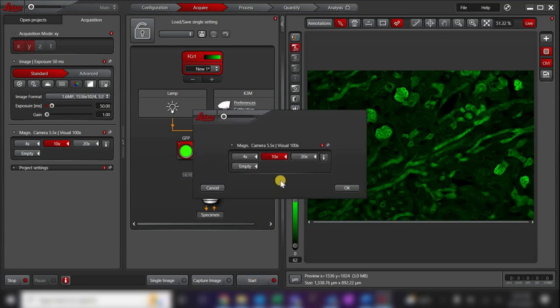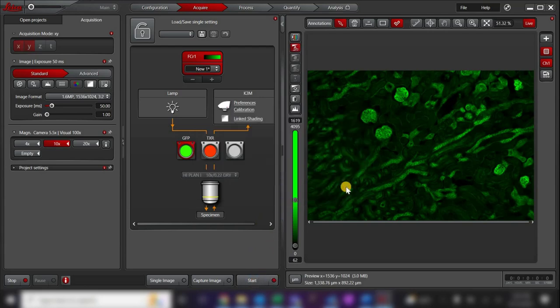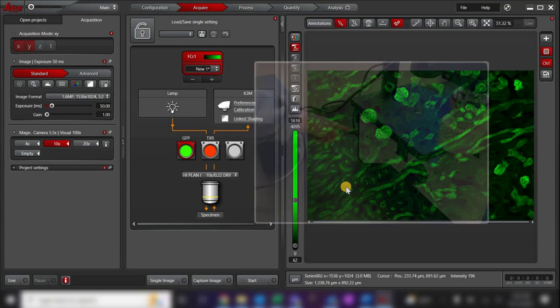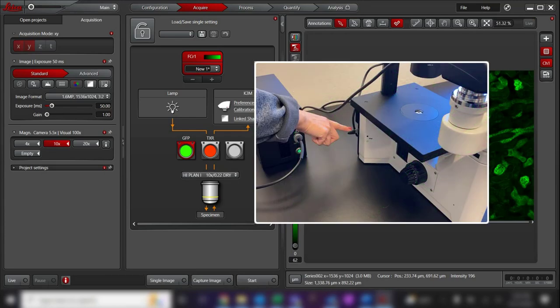Again, the software will check that the correct objective is in place. Remember to manually close the shutter on the microscope when you are not viewing or imaging your sample to prevent your sample from bleaching.